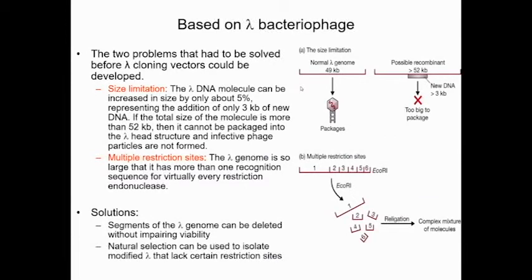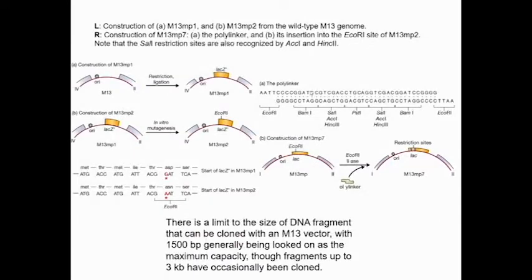And for the Lambda bacteriophage, okay, the LacZ gene here, basically that LacZ gene produces beta-galactosidase, and then in the presence of the chemical called X-gal, the beta-galactosidase will cleave the chemical X-gal and then produce the blue color.